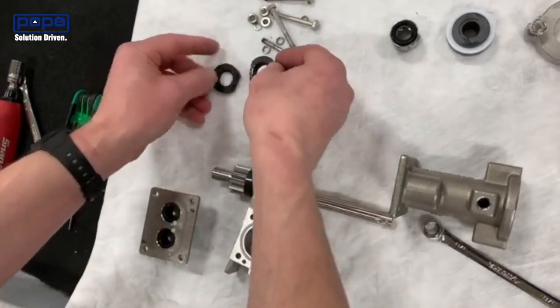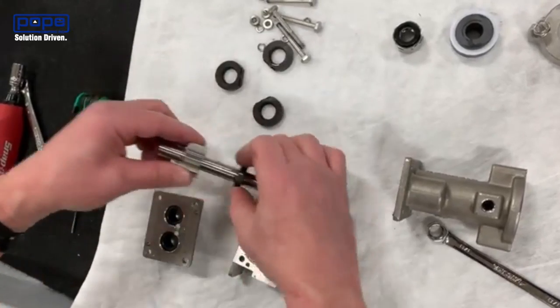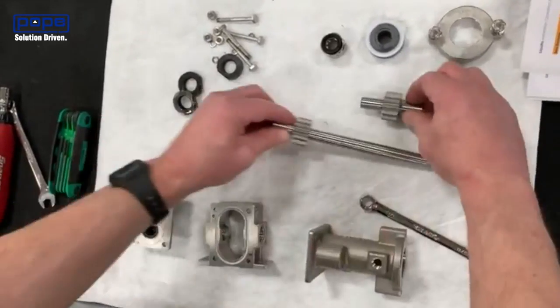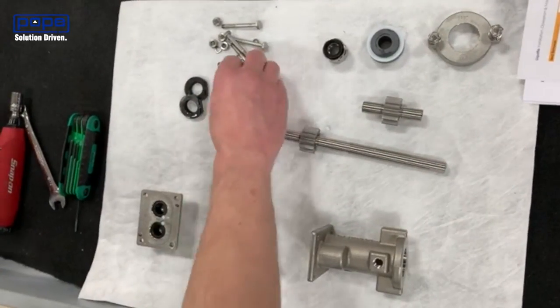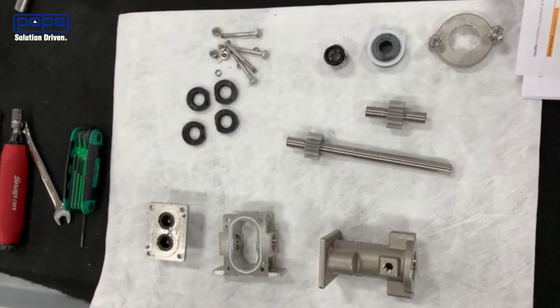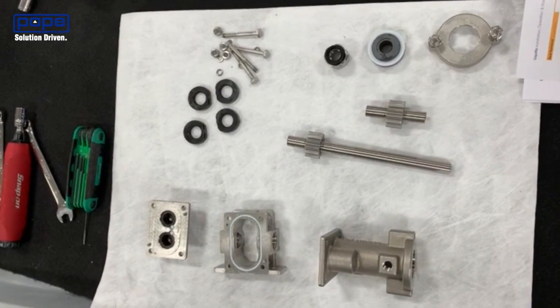We'll have another video that shows what each of the individual components are. But now we've got the pump apart — you can clean it at this point, get any grime or grease off of there, and then after that we'll start putting it back together.